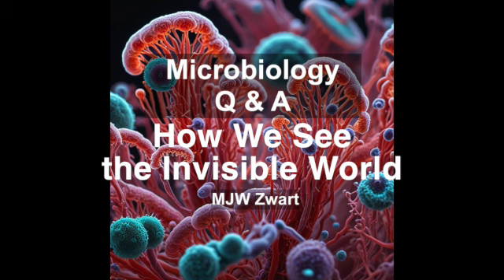Yes. But I know there are even more powerful tools out there, like electron microscopes. Oh, yeah. Tell me, how do those work? Well, with electron microscopes, we move beyond the limitations of visible light. Instead of using photons, we use beams of electrons to illuminate the sample. Electrons. How does that even work? It's a bit more complex, but the basic principle is similar to light microscopy. We use magnets to focus a beam of electrons onto a sample. And the way those electrons interact with the sample allows us to create an image. So it's like a microscope, but with electrons instead of light.